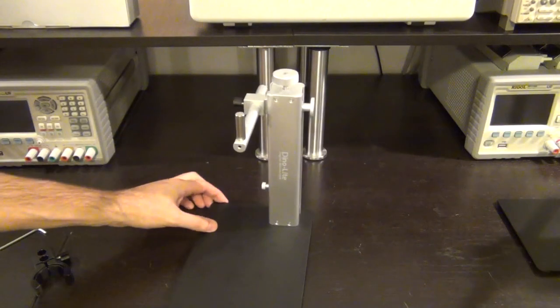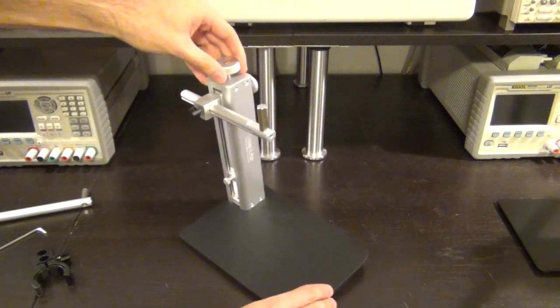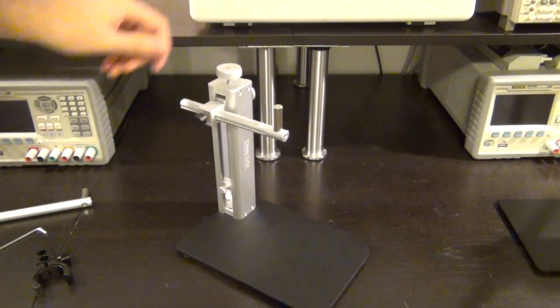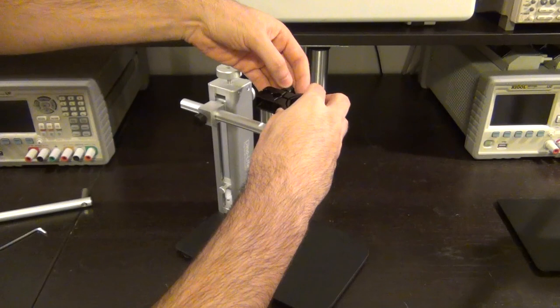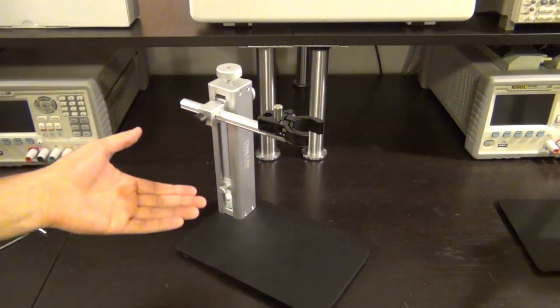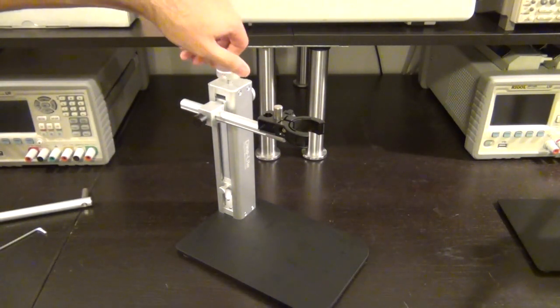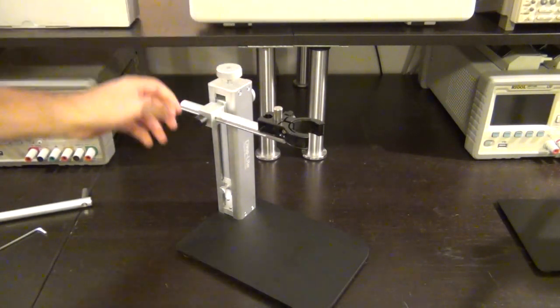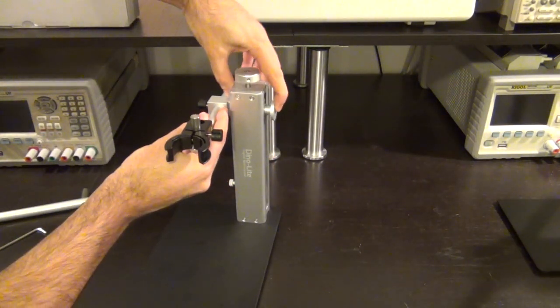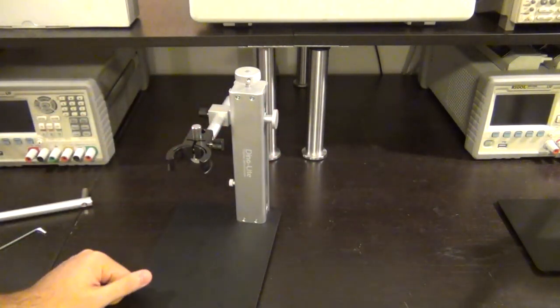And as far as going up and down, by rotating this screw, you can raise and lower the main microscope, like so. Let me put this back here so you can have an idea of what I'm talking about. And it has this other feature that I really like, because most of the time you'll be changing magnification and you want to move up and down quite a long distance. This is usually intended for mainly getting the focus. So it has a little button here on the side. By pressing this button, you can easily raise and lower this very quickly, and then it locks in place.